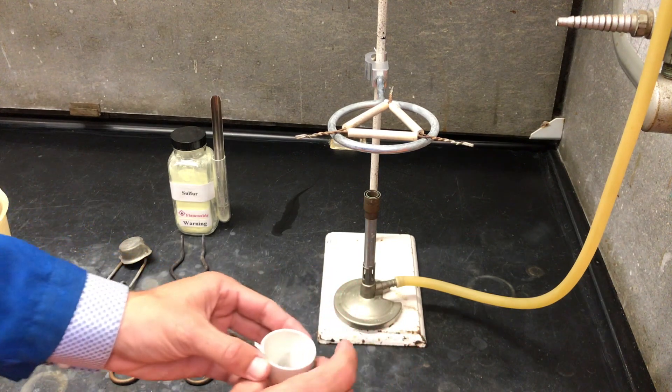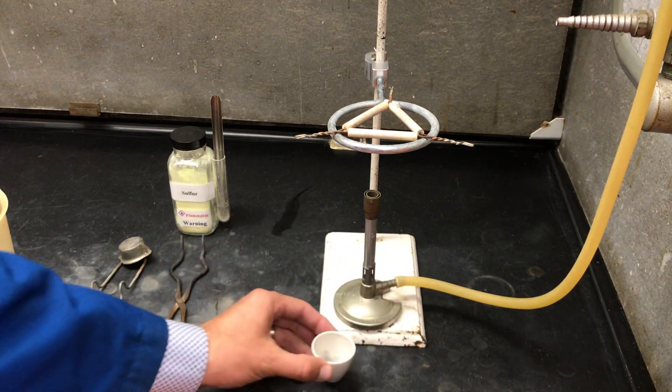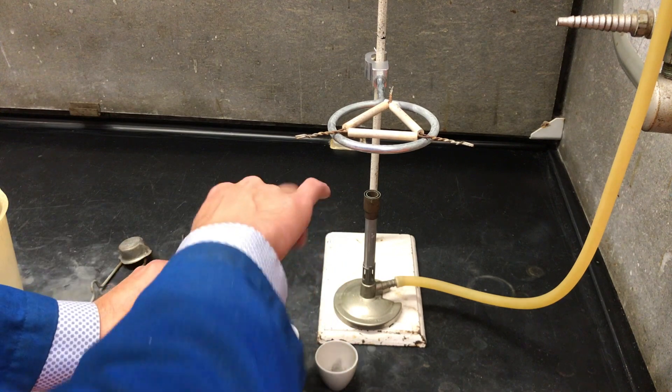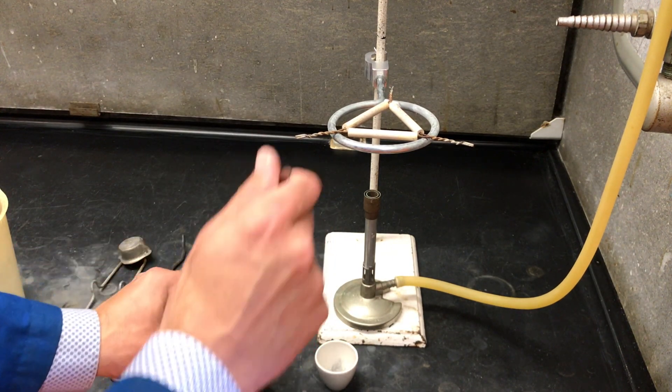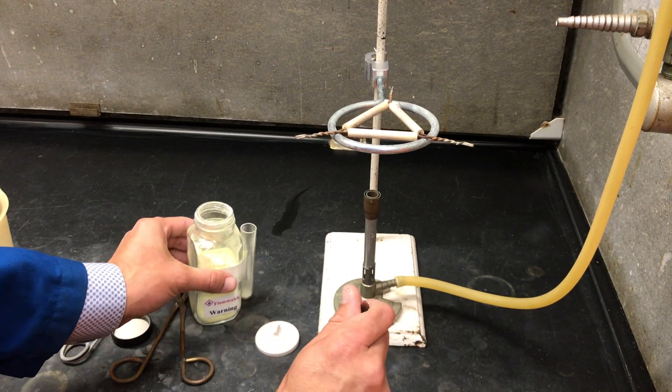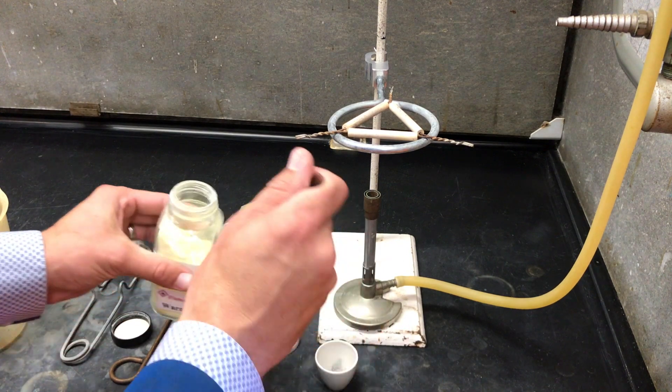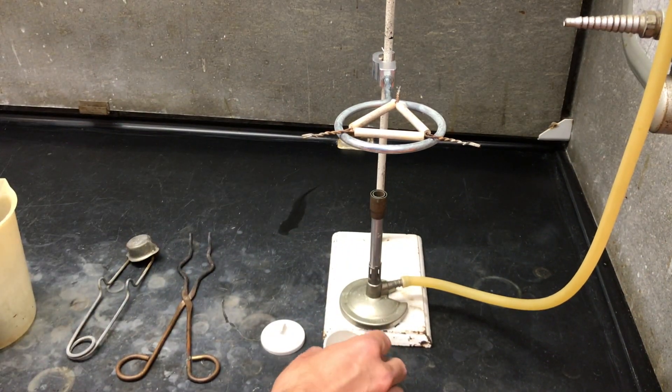We'll add enough steel wool to cover the bottom of the crucible and carefully sprinkle enough sulfur to cover the iron. Carefully put away our reactants.